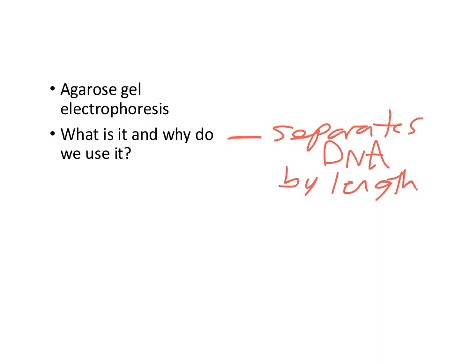What's a gel? What do I mean by gel electrophoresis? Name something that's a gel. Hair product. Any other thoughts? Right, so an agar. So when do we use agar? Not agarose, this is agarose, but when do we see agar? That's also a gel. In the lab, like Petri dishes. That's a gel. Agar media. You poke it and it's kind of spongy, but not quite. What's a common gel to eat? Jello, made out of gelatin.